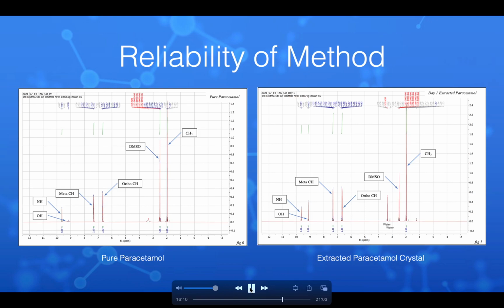We definitely have extracted paracetamol from the tablet, and the difference in mass of the crystals and the pure paracetamol are likely to be different due to moisture retained in those crystals while they were formed, rather than impurities, as we can see in this NMR spectra.